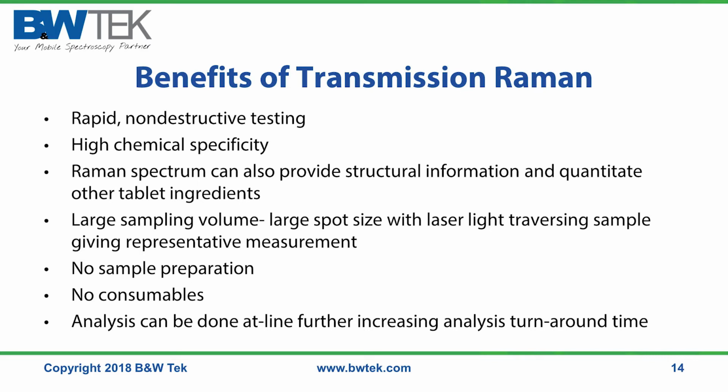Raman can also provide structural information, like differences between the polymorphic states and also crystallinity. You also sample a very large volume, like a 3, 4, or 5 millimeter spot size. That means you can actually get an average spectrum of the entire reading of your tablet or capsule.